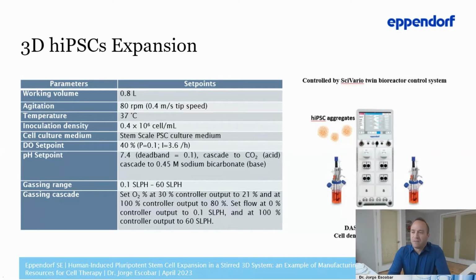Before running any kind of experiment, here specifically in bioprocess, we have three important components to consider. First of all, the bioreactor, the controller, and then finally the inoculum. So let me explain all of them in detail. First of all, I would like to explain the bioreactor. So how do we set up the bioreactor?